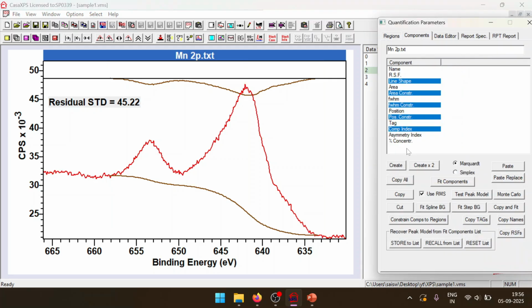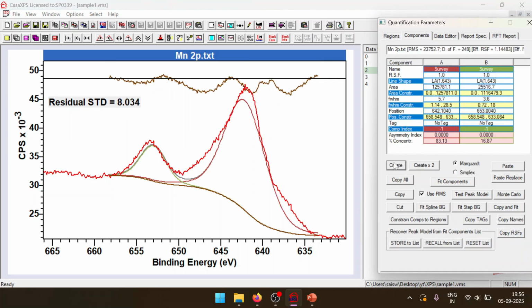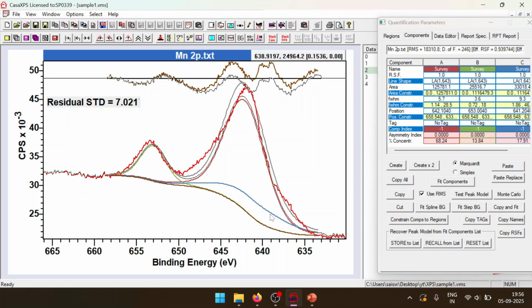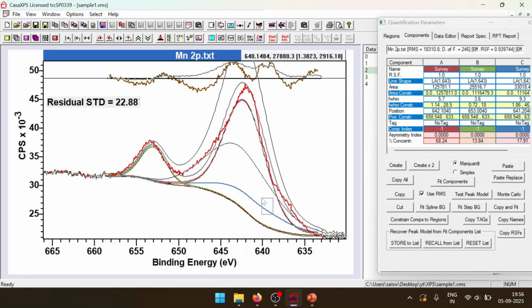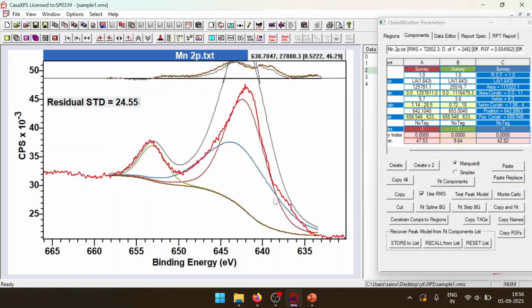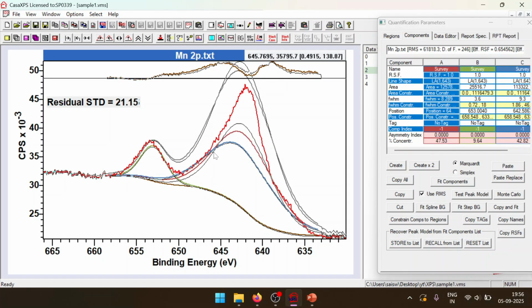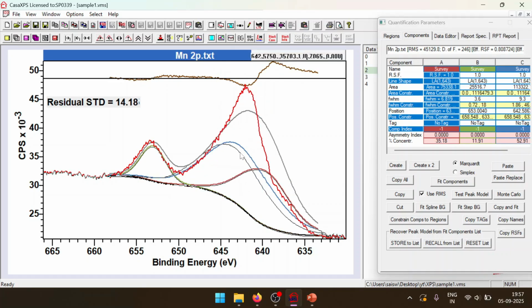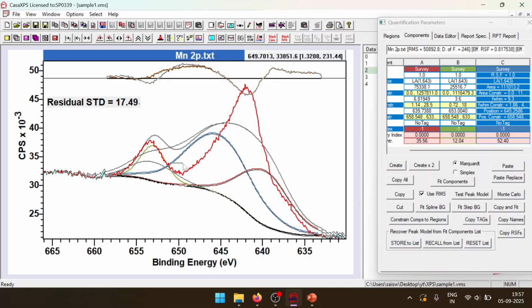Then after you take components, now that your component is like this, you can pull it and vary the shape. Once you take it inside, it goes thinner and things like that. Once you start using it, you will get to know how these peaks shift or change their values, or the shape of the peak, and how you can change them with your mouse.